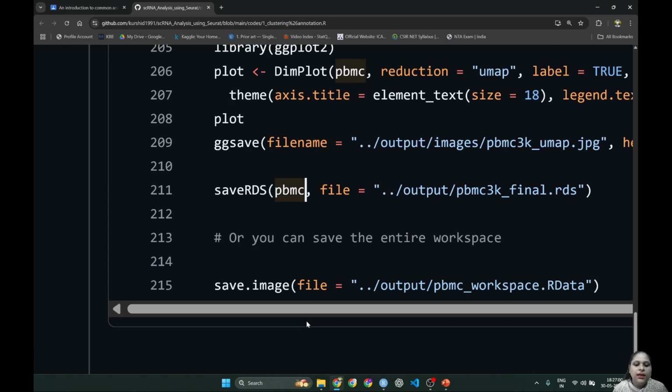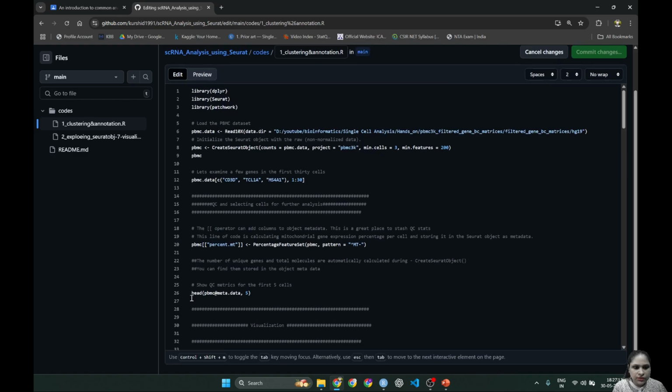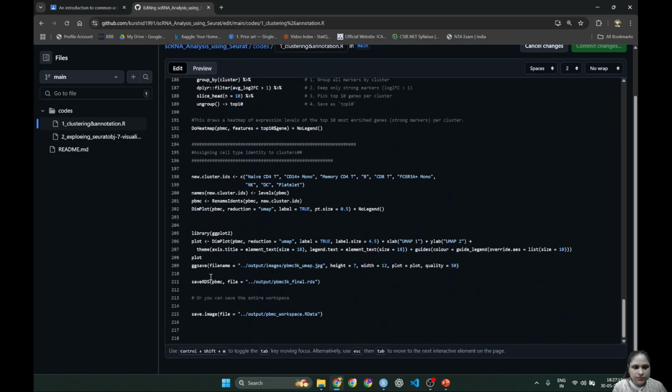Okay, and that is why I have added this one. What I will do is edit it here, and I'm just commenting it out.